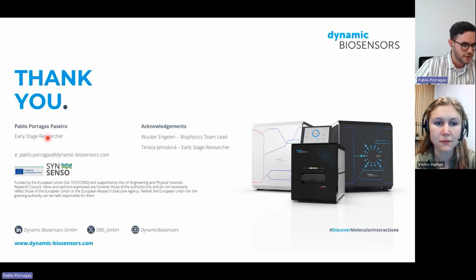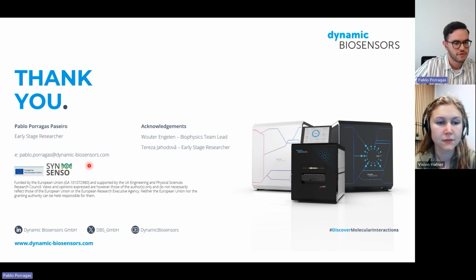So I hope with these few examples, I've been able to demonstrate the value of measuring conformational changes with these DNA origami nanolevers and demonstrate a little bit about how we do it here at Dynamic Biosensors.